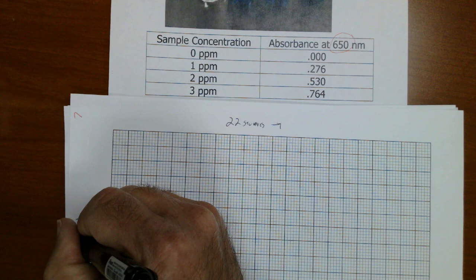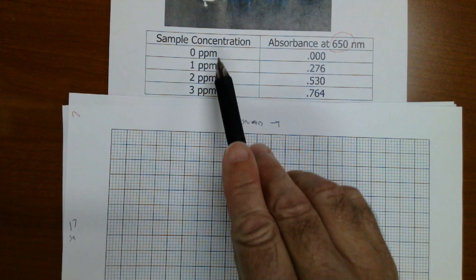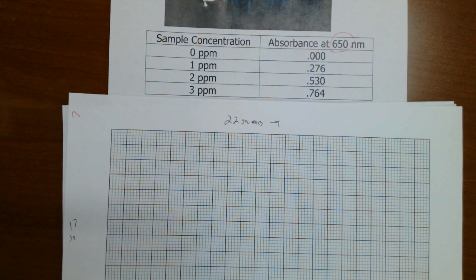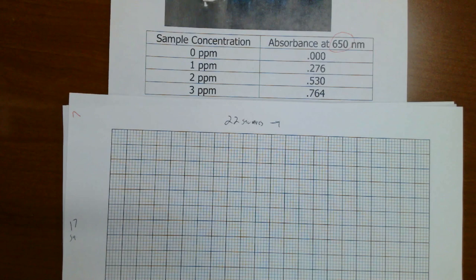Now, the concentrations range from 0 to 3 ppm. So I'm going to choose 7 squares to represent 1 part per million. So 2, 4, 6, 7. So this is our 1 part per million, and we've got 0 here. Here's 2 parts per million, and then this is going to be 3 parts per million. And so I'm going to label my x-axis as the part per million concentration of phosphate ion. Let me show you where I have that.